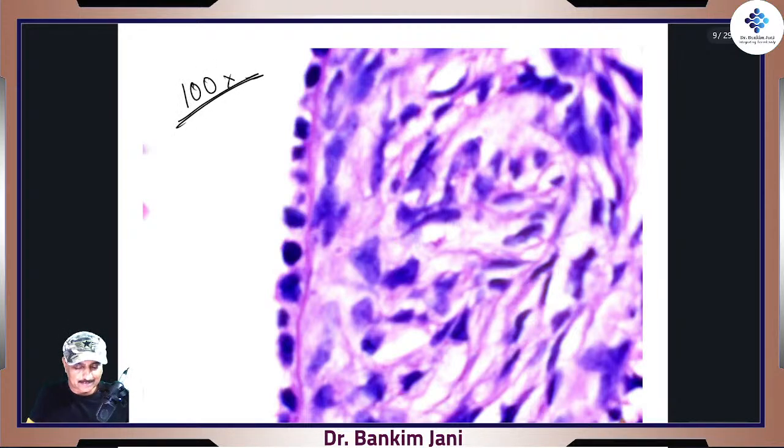Males would think that no, we don't feel like they are precious stones because they are very expensive. Or it looks like samosa also, right? Some of the shapes look like samosa. And this one, say for example, looks like rasmalai. But basically they are simple cuboidal, right? Simple cuboidal.